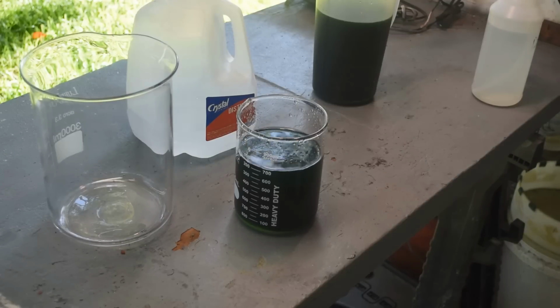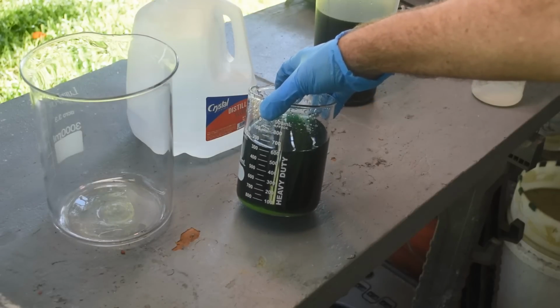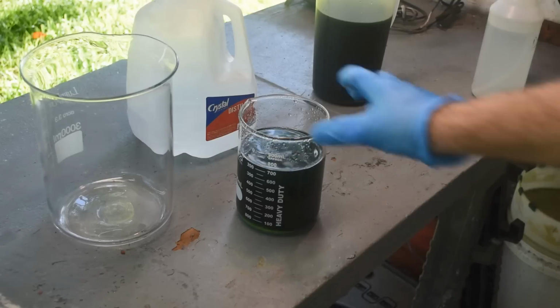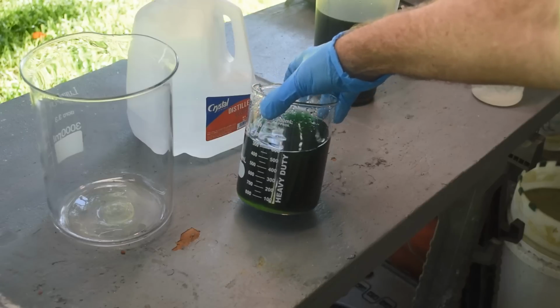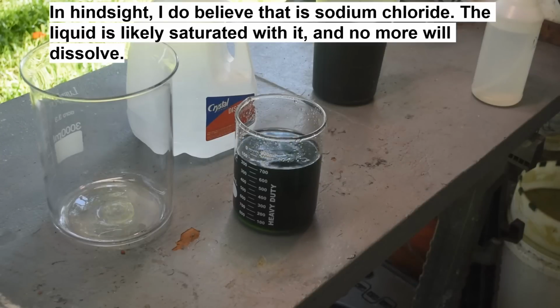Not sure what those solids are. I don't believe it's palladium chloride because it's the wrong color. Although I will double check that. Do a little quick research on that just to make sure. But it really doesn't look like we've got a lot of palladium chloride settling out of solution in there, at least not at this point. That might be sodium chloride still. I'm not sure. Something.